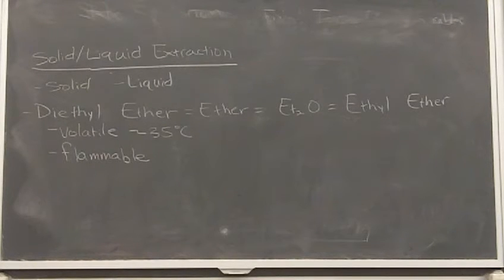It very easily can be ignited just by heat. Like, it doesn't need a spark. It doesn't need a flame nearby. Just the presence of heat could cause the ether to be on fire, okay? So we need to take precautions whenever we use ether.